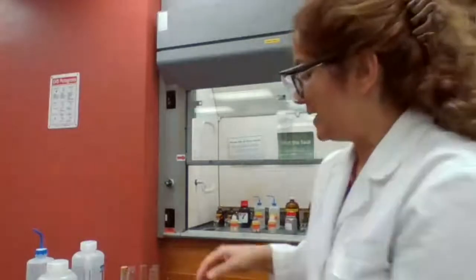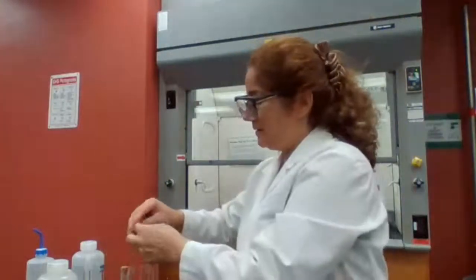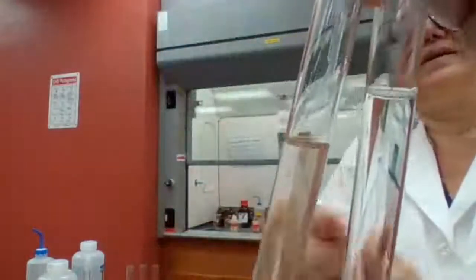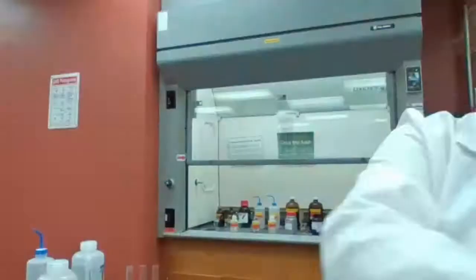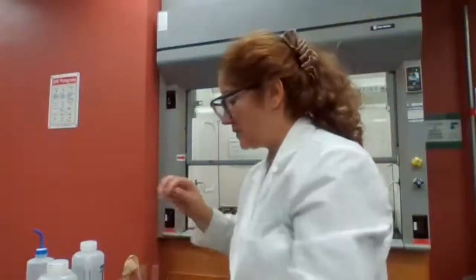Yes, that is the positive test. If the precipitate does not dissolve and it stays cloudy, that is the positive test. Okay. It has not dissolved yet, so we can do that. You can record it as part of it.